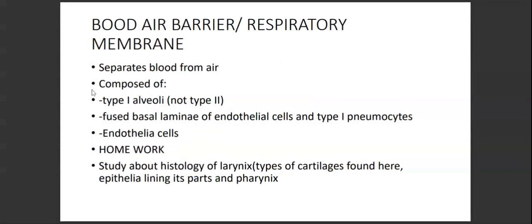Okay. So this is the last thing we're going to look at today, but not the least. We're going to look at now the blood.